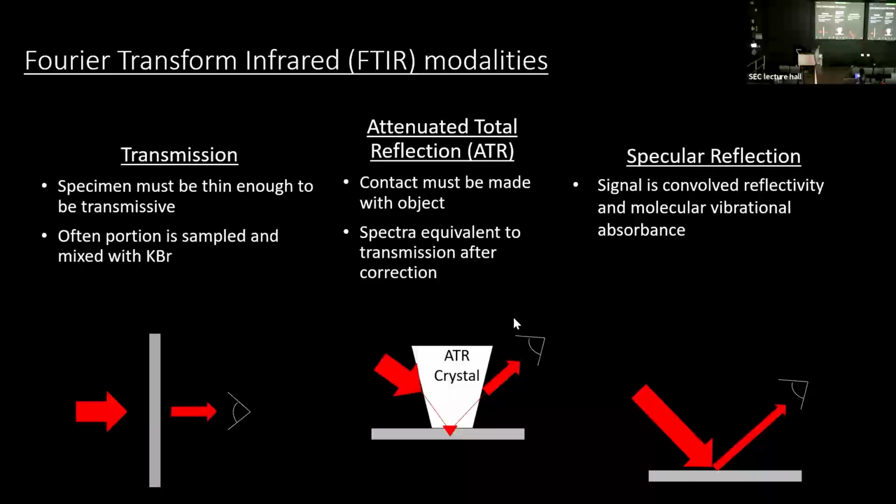You can mount ATR crystals from the top or from the bottom, doesn't matter. We had one from the bottom. There's an amusing story of a bowling ball company that worried about the surface chemistry of their bowling balls, so it would slide down the lane just right. They didn't have to do any sample prep. They just put the bowling ball directly on the ATR crystal, take the measurement, and move on. And that was their quality control. So you can do no sample prep and just contact it with the ATR crystal.